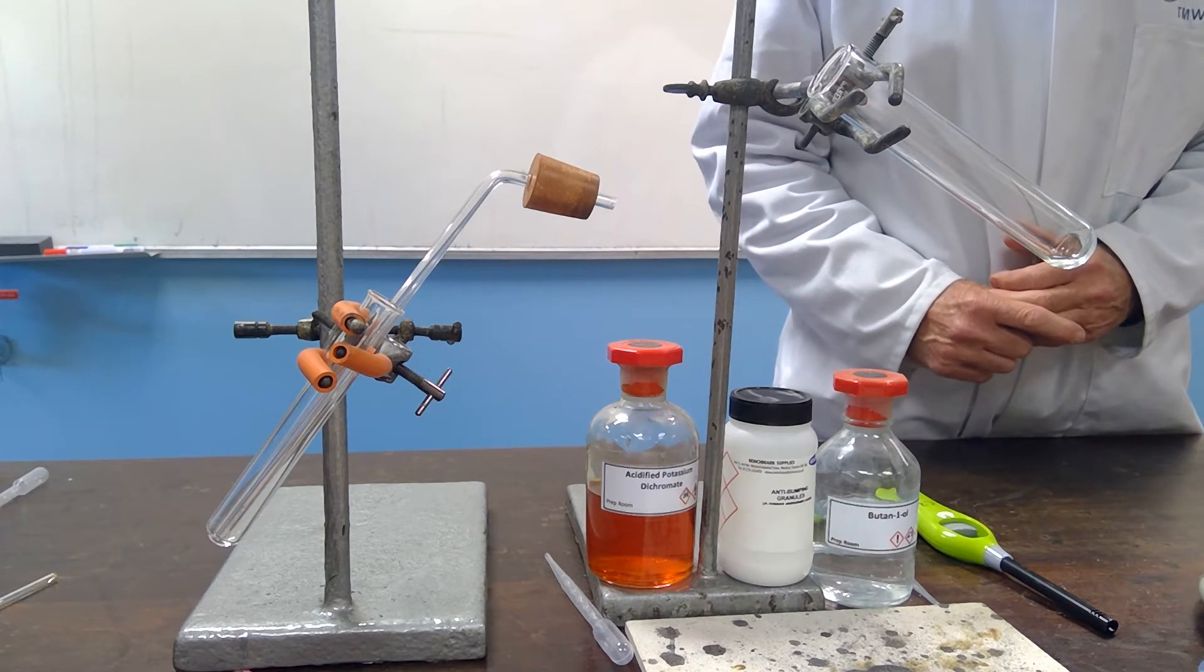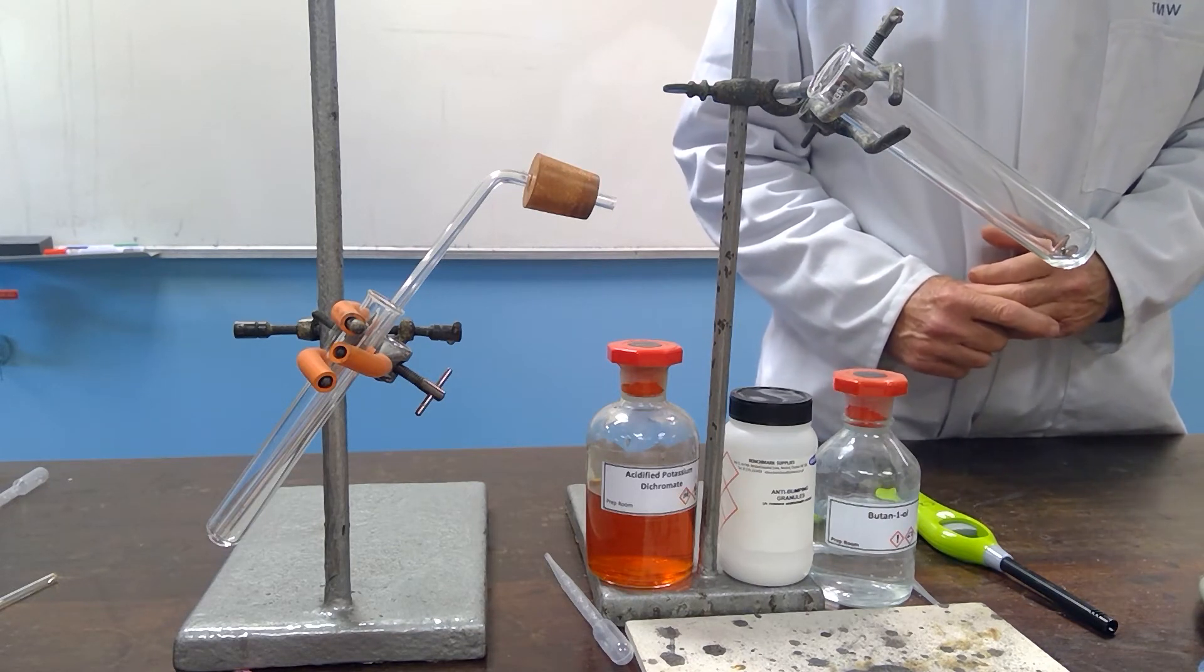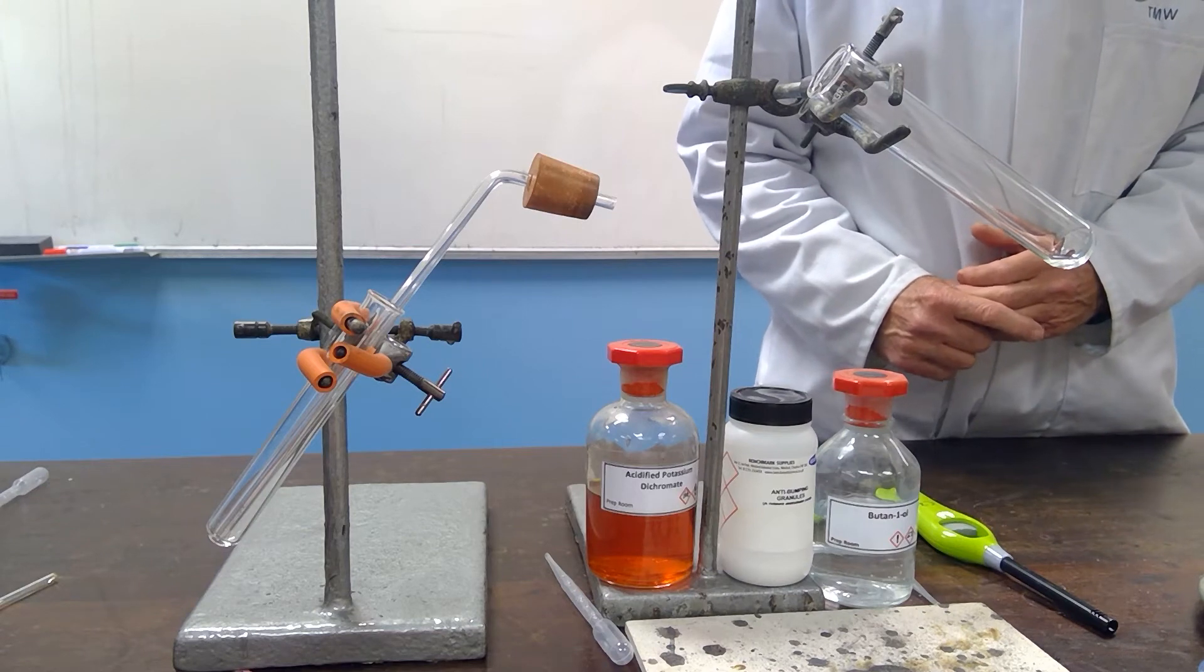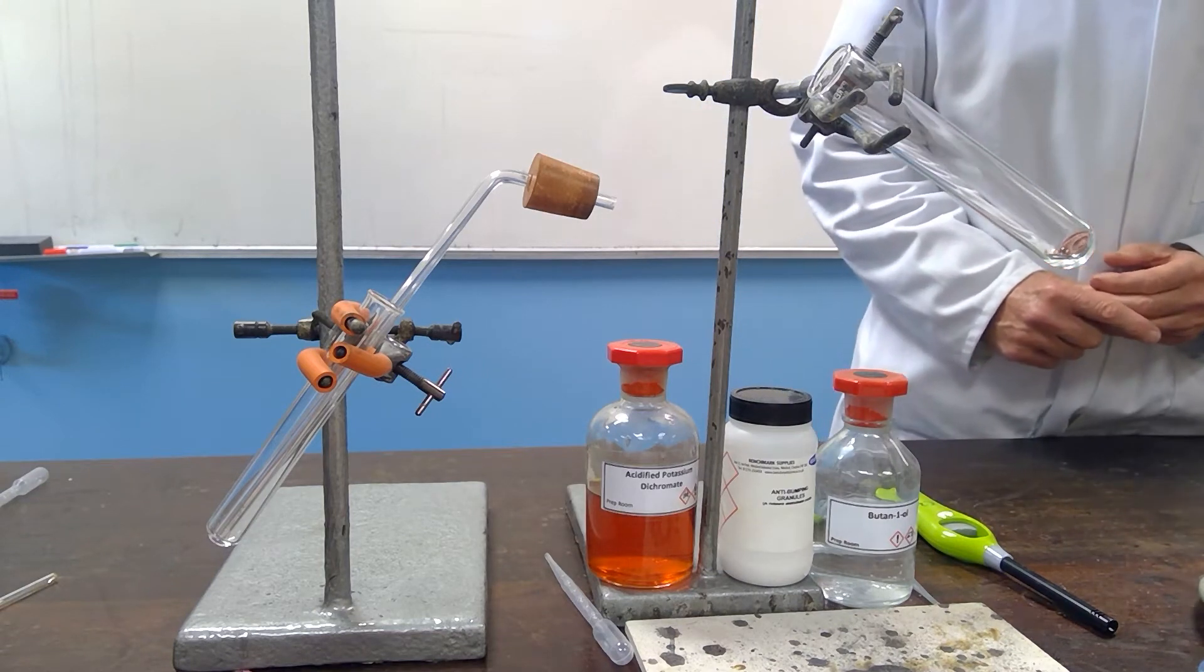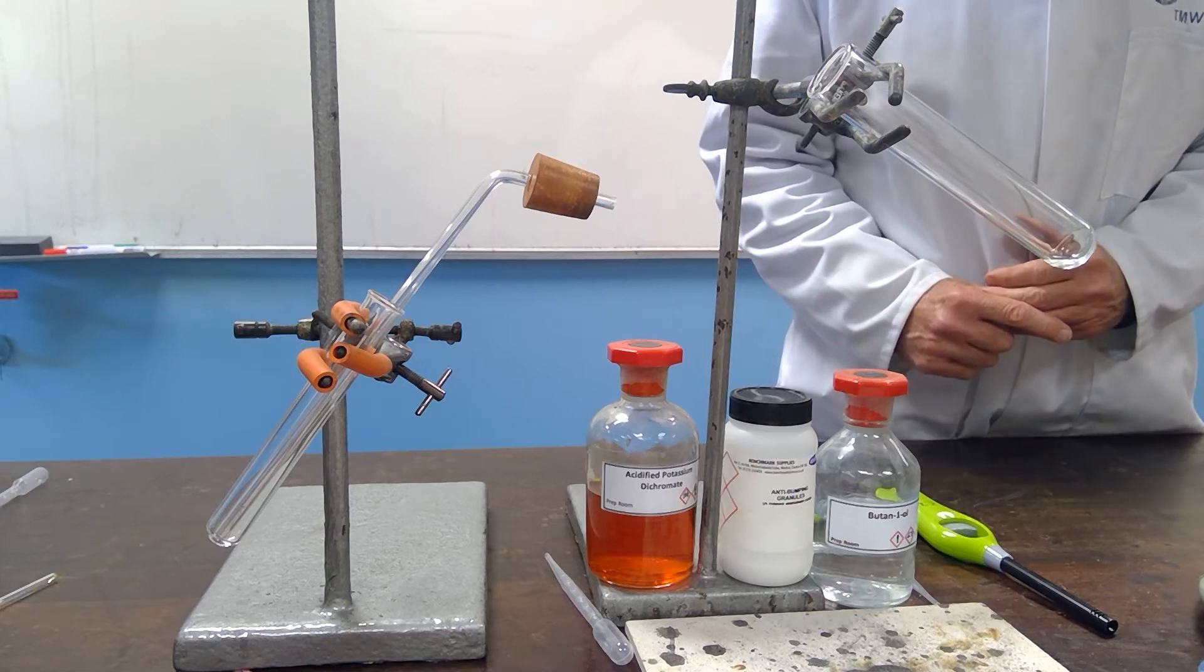In order to do the second test, you need to distill the products that are formed as a result of the reaction between the acidified potassium dichromate and the butan-1-ol and the butan-2-ol.